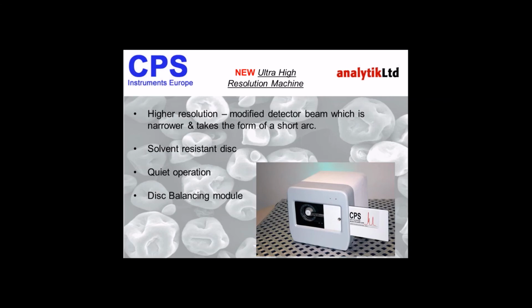The picture I've got here on the screen is the latest CPS instrument, and many changes have been applied to this instrument. The most important one is the fact this is a UHR instrument, which offers ultra high resolution capability. The big difference between this and previous instrumentation is that the previous instrument had a vertical line for its light source. The new instrument has a modified detector beam, which is narrow and takes the form of a short arc. The idea being, if it's an arc, then it will sit better on the moving bands. The disc is also different.